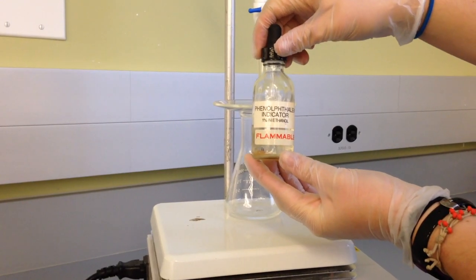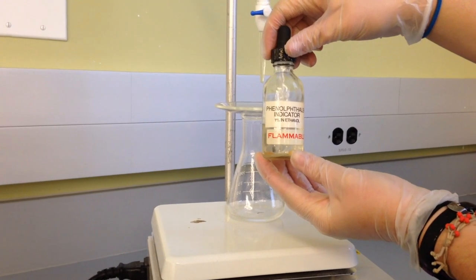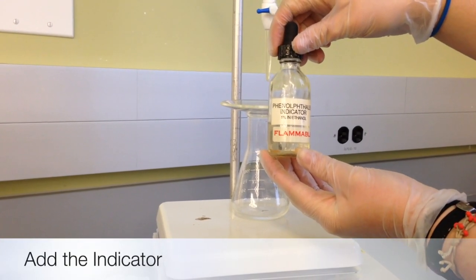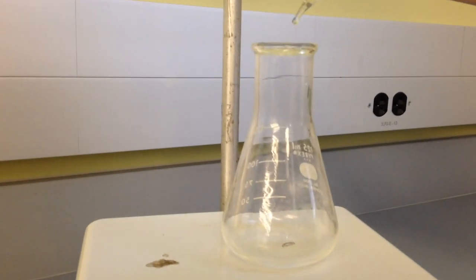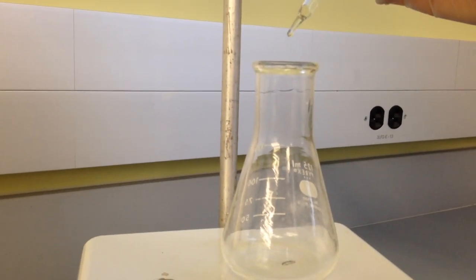Now that our burette is set up, we will prepare our solution to be titrated. We will now add an indicator, in this case two drops of phenolphthalein, that will turn the solution pink once the acid is neutralized.